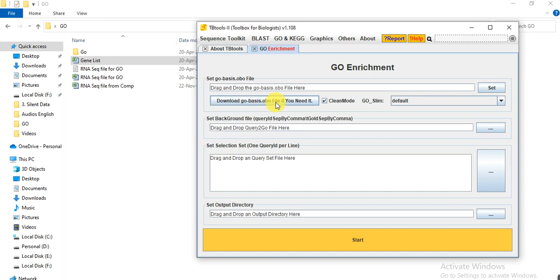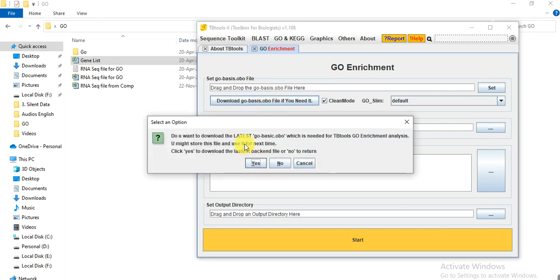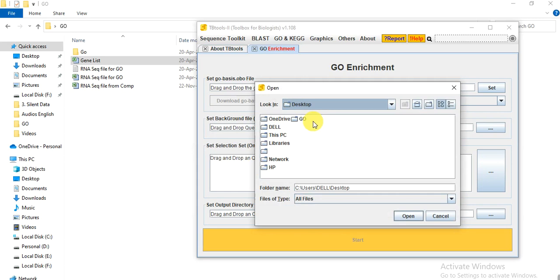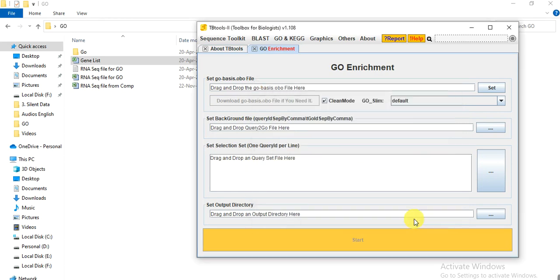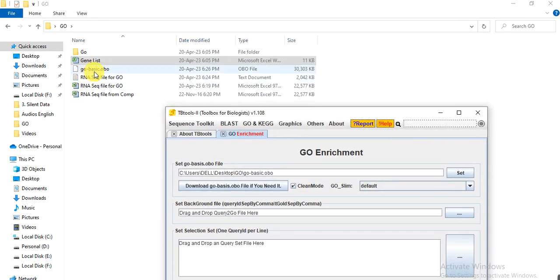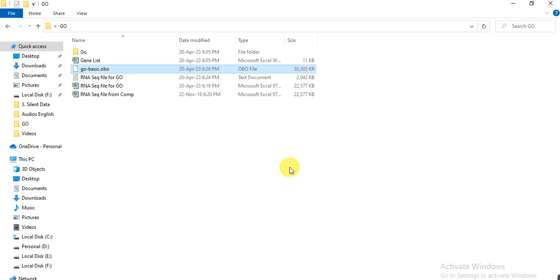First, download the GO basic OBO file. Click on the download icon and it will ask if you want to download — click yes and select the destination folder. It will start downloading. The icon will appear dim while downloading and will become bright when the download is completed. The file is about 30 MB.